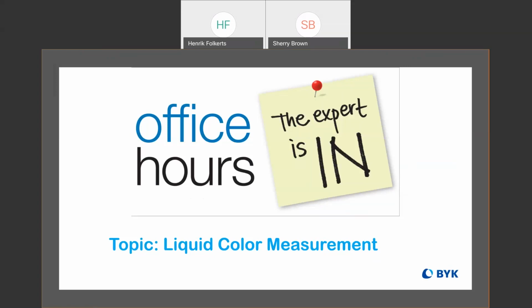Another question, Corey here. What cuvette is best used for Hazen measurement? For Hazen measurement, you could use any of them, the 10 millimeter square, the 11 millimeter round, or the 50 millimeter. Just be aware that you're only going to want to compare measurements taken with the same cuvette. So you don't want to compare a measurement taken with a 50 millimeter cuvette with another liquid that was measured using a 10 millimeter cuvette, because it may show measured differences where visually there are none, or vice versa.